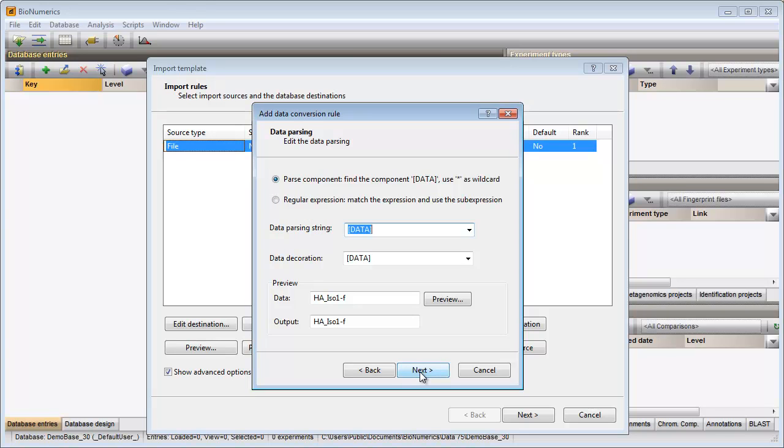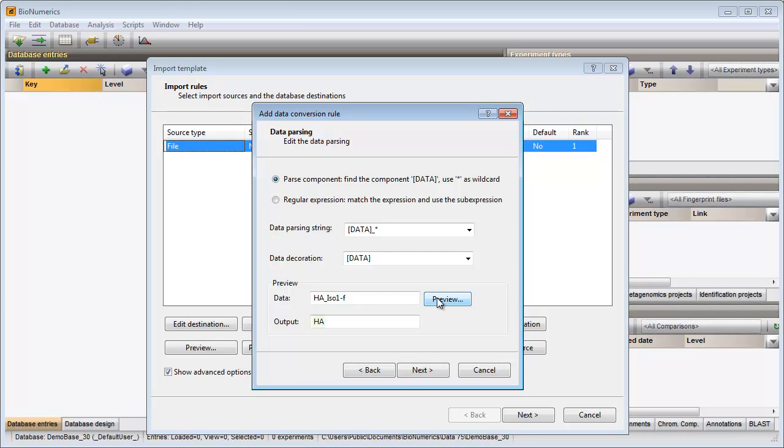The text appearing before the underscore contains the sequence name, so I specify this parsing string. The preview shows me that the correct part of the file names is linked to the sequence experiment name.